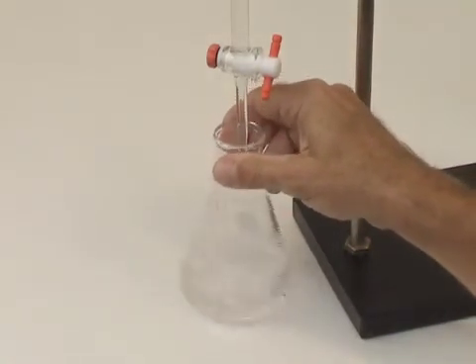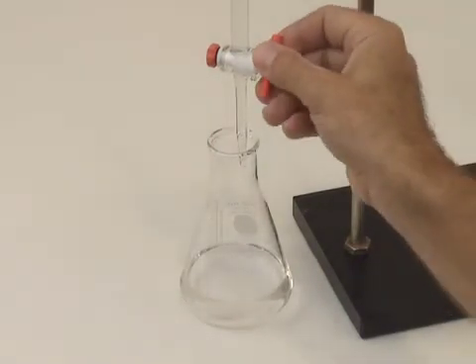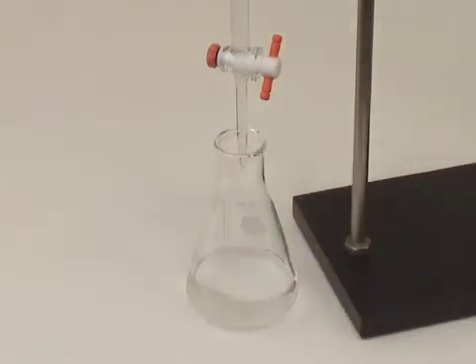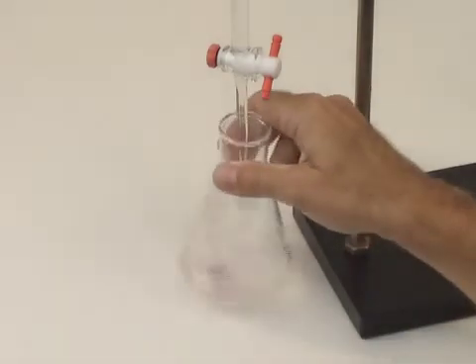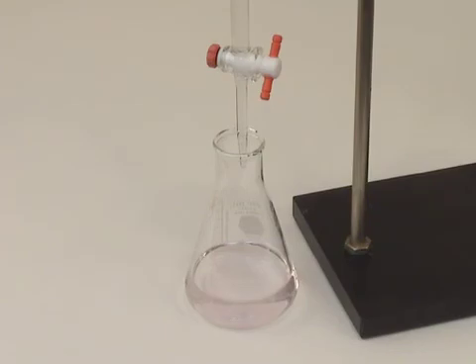The end point is reached when there is any faint color that persists upon mixing. Don't forget to write down the volume at this point. So there you have our end point, and that concludes this video on titration techniques.